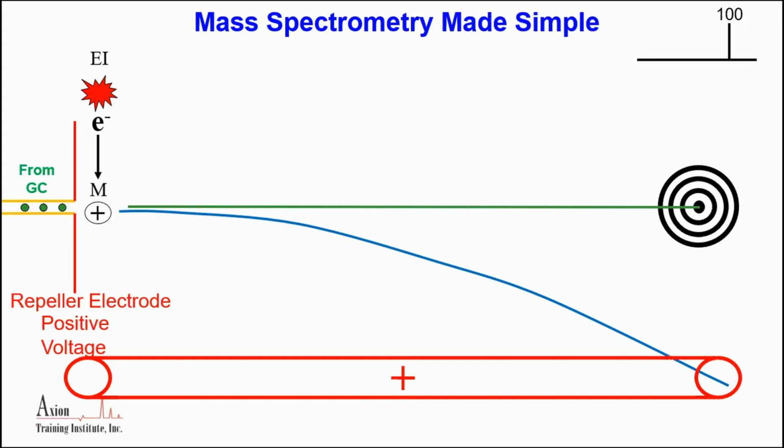So as crazy as this sounds, first of all, that's how mass spec works. And also, if you ever look at a modern balance, look at your Mettler balance, your Sartorius balance, your analytical balance works the same way. If you put a weight on it, or you put a sample on it, and the pan sinks down, then inside there's an electromagnet, it turns on, and it pushes the pan back up until it reaches 0. And it measures how much current it needed to put into the electromagnet to push the pan back up. So as crazy as it sounds, this is actually how we weigh things in a modern world.